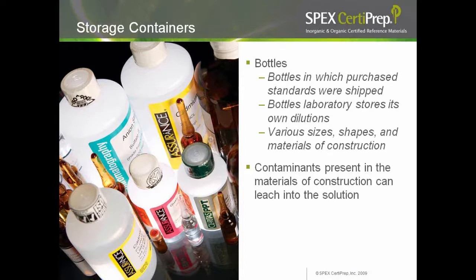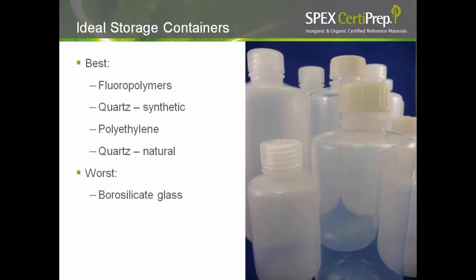Next to be considered are bottles. Calibration standards are shipped to you in bottles, and you store diluted solutions in bottles. Trace impurities from the walls of bottles can leach into solution — the quantity depends on the material used. The ideal storage containers are fluoropolymers (Teflon), synthetic quartz, polyethylene, and natural quartz. Borosilicate glass leaches boron and silicon and is not suitable for trace metal analysis.